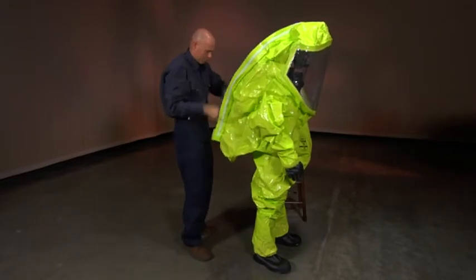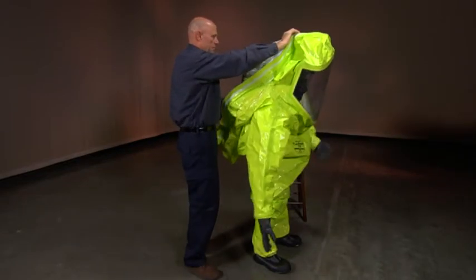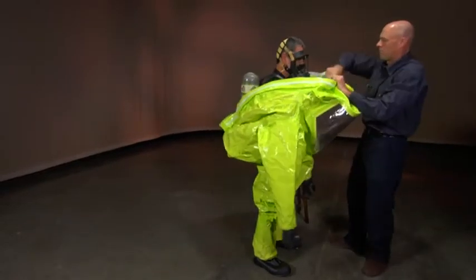Working from the top of the head down, carefully remove the hood from the wearer by rolling it away from the wearer, being mindful that the outer surfaces are rolled away from the wearer.